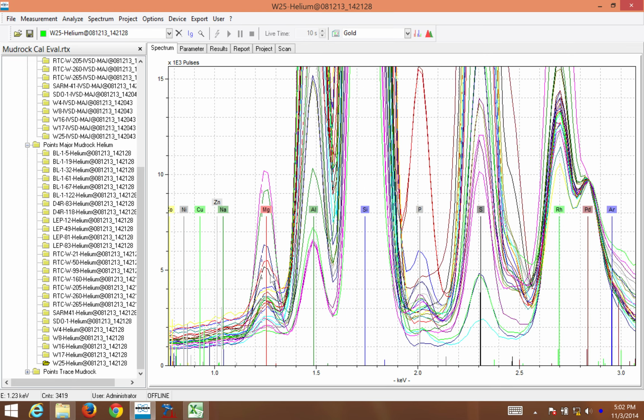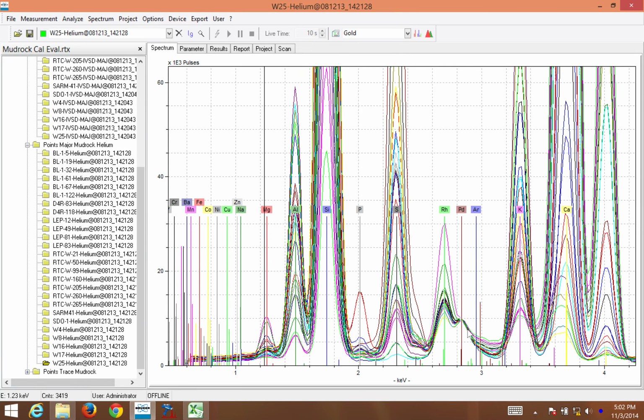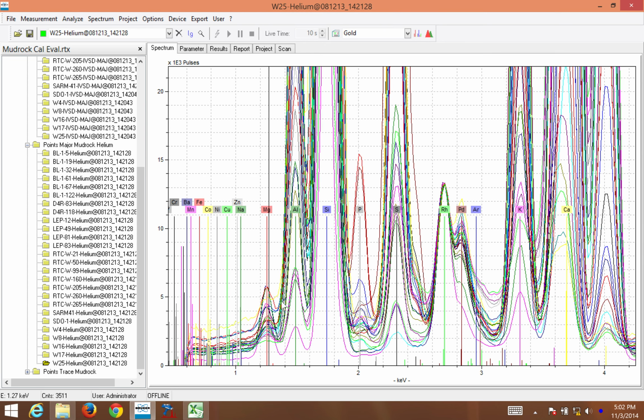Look at all this variation now in the magnesium. The baseline is completely off. My rhodium is just too variable, and there's nothing I can do about that. In fact, normalizing to different parts of rhodium are going to create even more severe problems. So what do I do? The answer is I choose a different normalization. It's very messy normalizing to rhodium right now for magnesium.